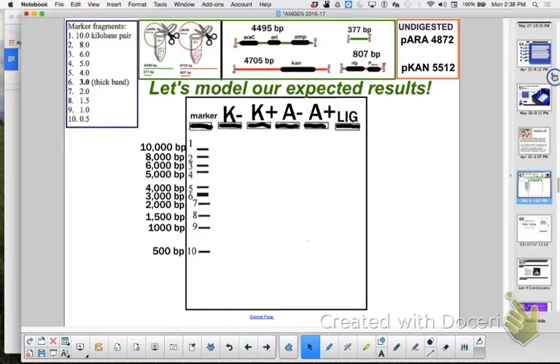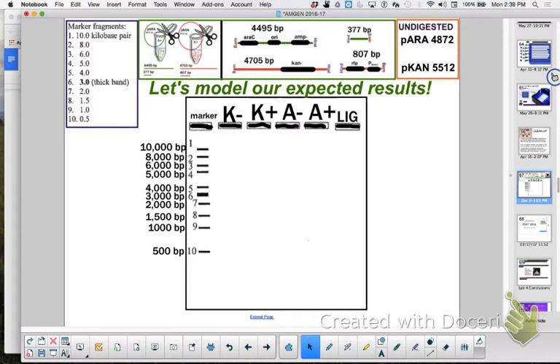When we look at marker we need to look at fragment sizes. Which of these rows have fragments in them? K plus and A plus because what does the plus mean? You added restriction enzymes. What do restriction enzymes do? Cut at a specific series of bases. If I look at whole pecan it's 5,512 base pairs, but if I've cut it then I should have two fragments: a fragment that's 807 and a fragment that's about 4,700 base pairs.